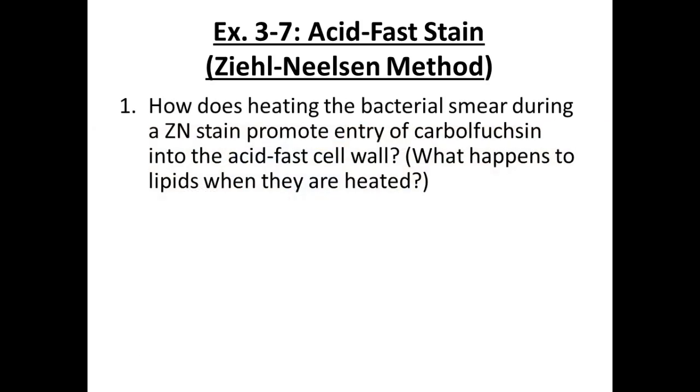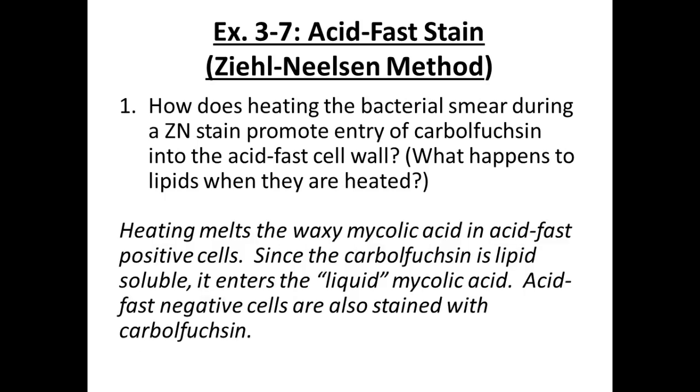Okay, so how does heating the bacteria during this part of the procedure help? What happens to those lipids when we heat them? They melt, right? And the dye is going to stick inside of them. So the heating melts the waxy mycolic acid in the acid-fast cell walls. The carbofuchsin we're using is lipid soluble, which means it dissolves into that liquid.